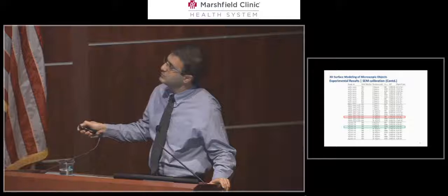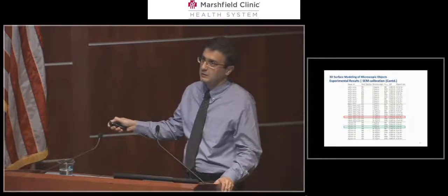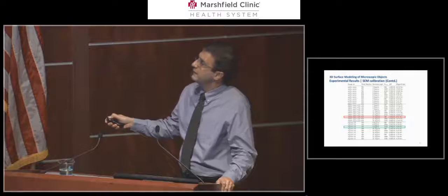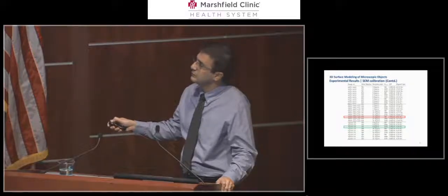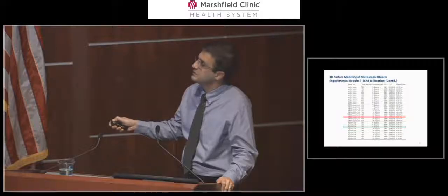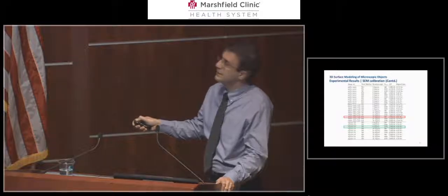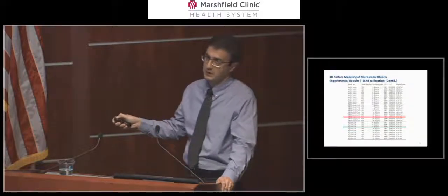In the second column, you see the total number of matching points, the rotation angle given by the SEM machine, and the number of generations for the differential evolution algorithm, which we utilize as an optimization strategy. And delta R is the difference between the rotation angle given by SEM and the rotation angle we estimated.